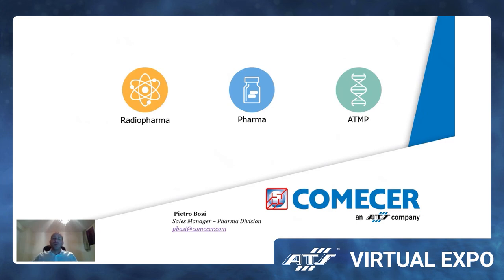So as a conclusion, we saw how ready-to-mix unit dose devices handled and filled in an aseptic environment offer a potential solution to increase product sterility and formulation uniformity. At the same time, it reduces logistic and pharmacy operations, reduces medication errors, and improves patient safety. The implementation of a GMP manufacturing process fully embedded with isolation technologies and the right amount of automation, among all the other advantages, can drastically increase product quality and operator safety.